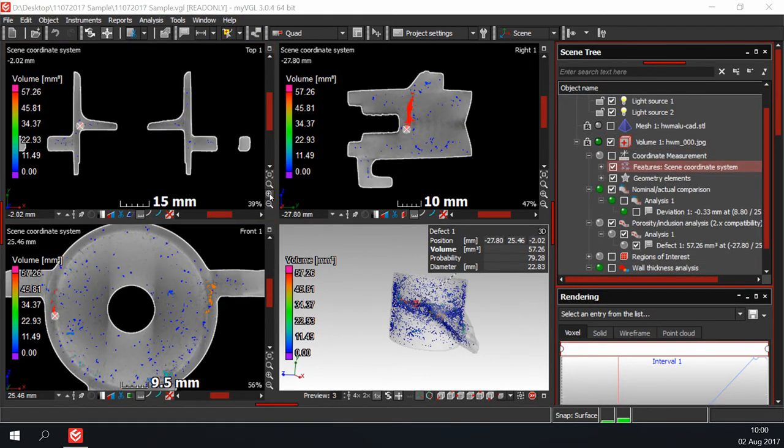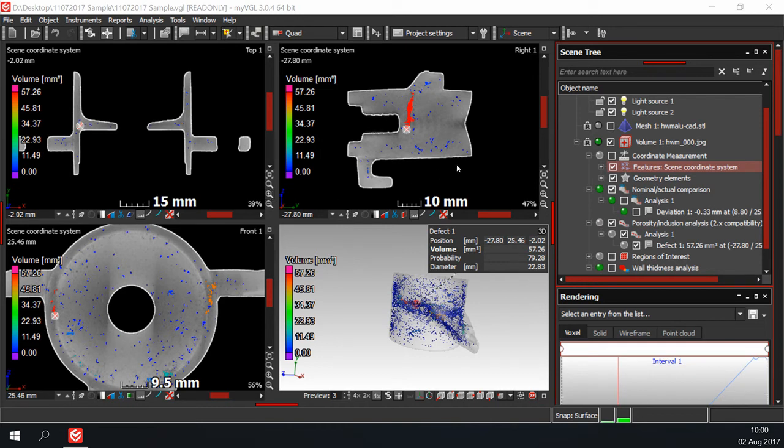For now, I will only give you a brief overview of some of the features in the scene tree. The scene tree will find the data set and all the analysis that has been performed. The plus and minus boxes expand and collapse these analysis.